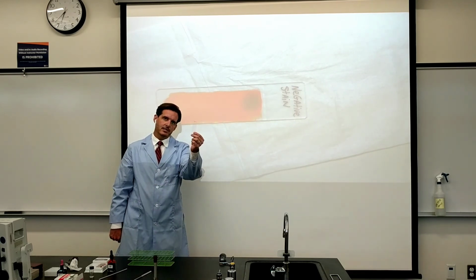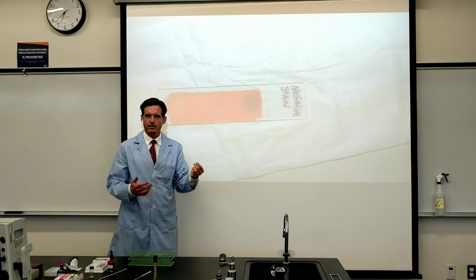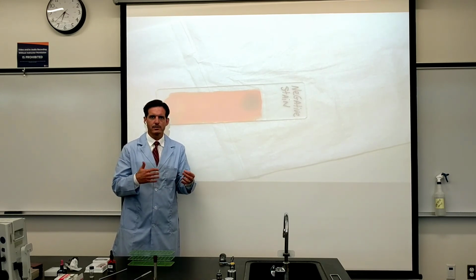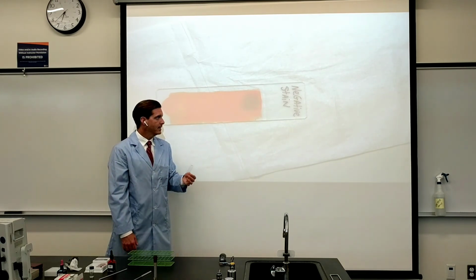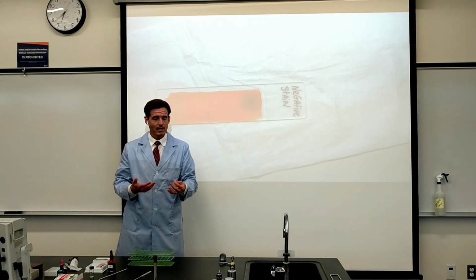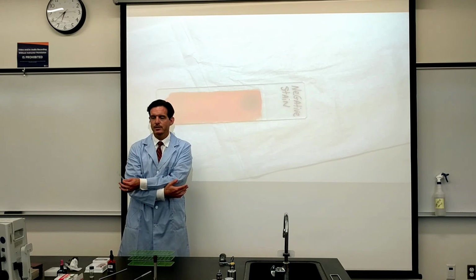Now, the bevel edge slide, I'm just going to put into the biohazard area to get rid of it. We would treat any slides from clinical specimens as not something we just throw in the trash, but something that we would put into the autoclave pile biohazard container so that eventually it would get destroyed without there being any potential infectious material. In this case, realize as well that these bacteria that are mixed around in the dye are actually still alive. Simple stains, by contrast, the bacteria soak up the dye, or the cheek cells soak up the dye, and when they do, they die.